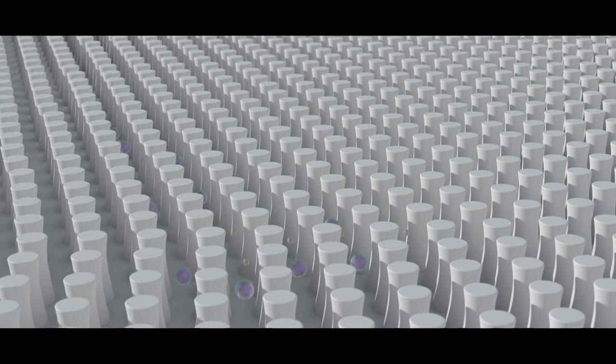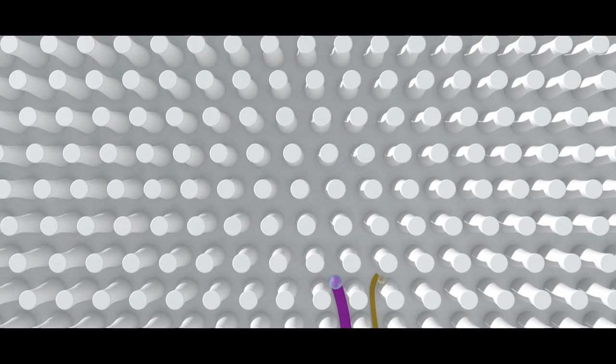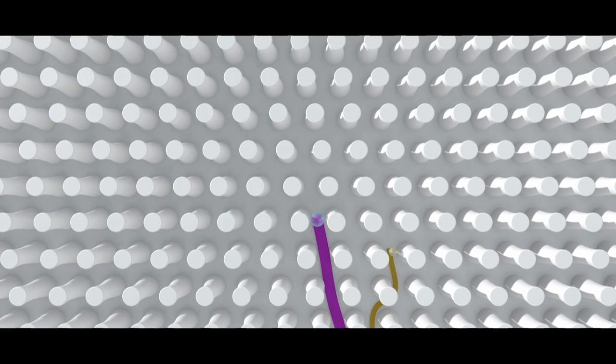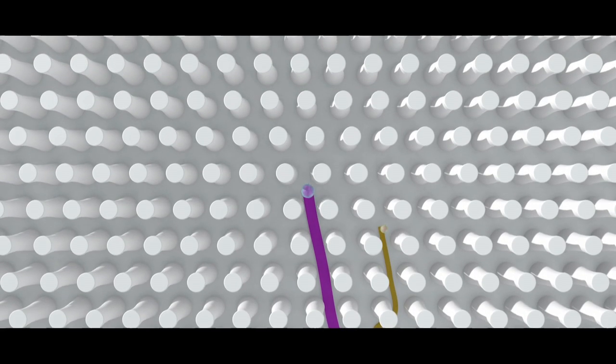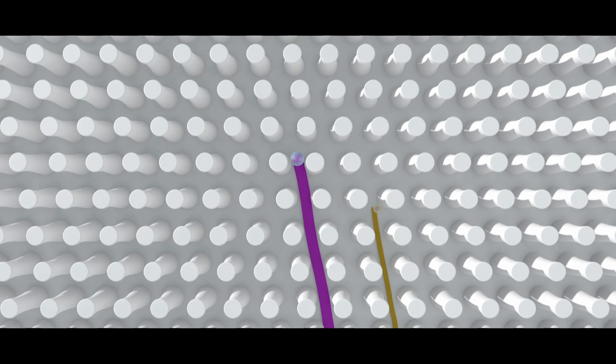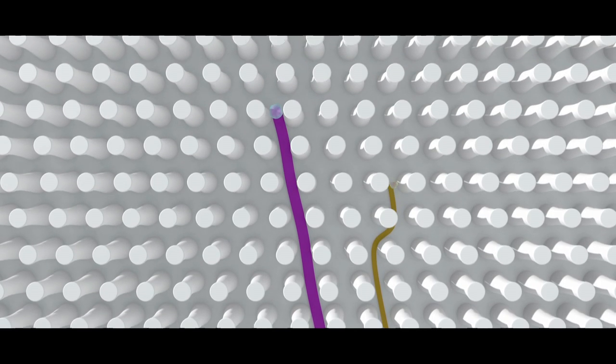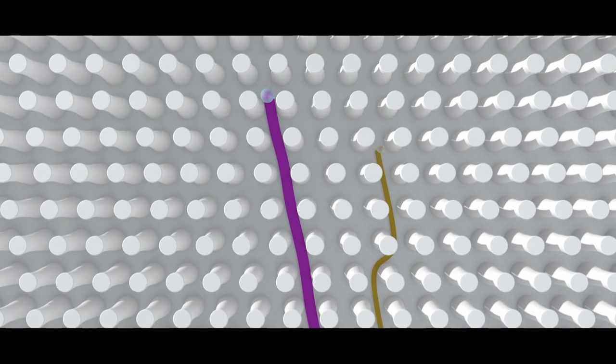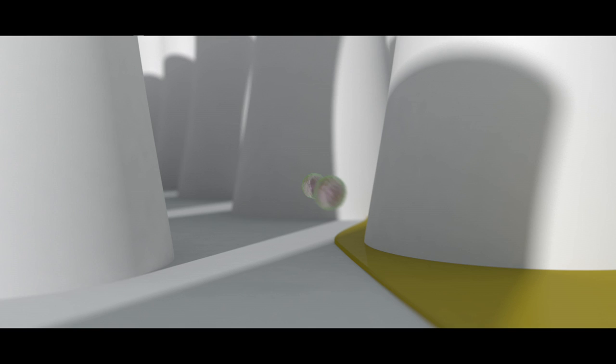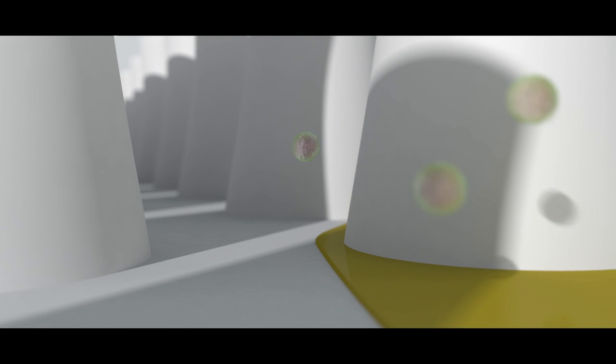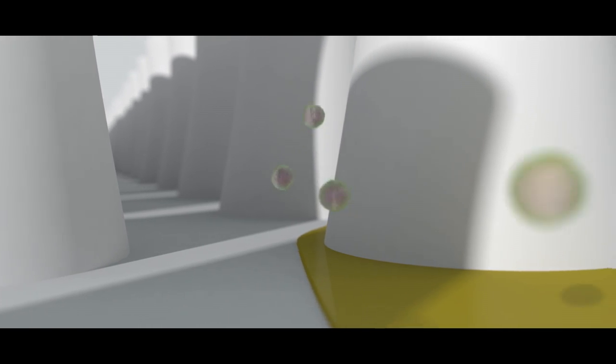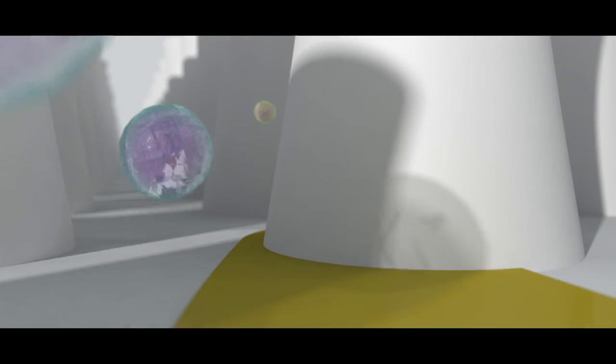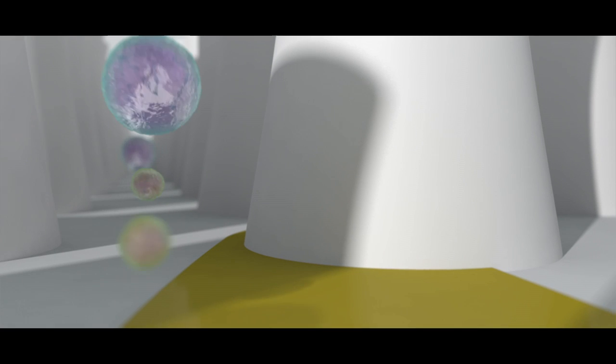How? The pillar geometry splits the exosome-carrying fluid into streams. Smaller particles can stay within a single fluid stream, zigzagging around pillars, while larger particles cannot fit within a single stream and are deflected, separating them from the smaller particles.